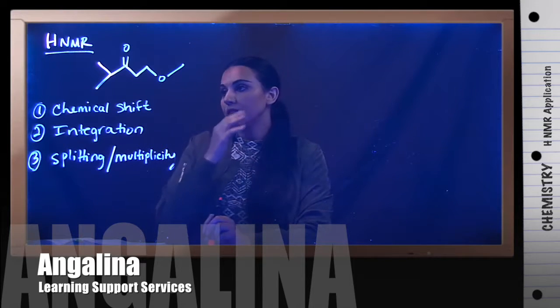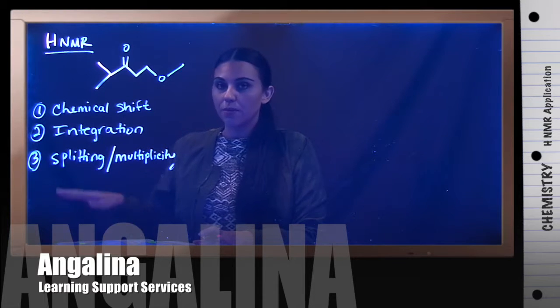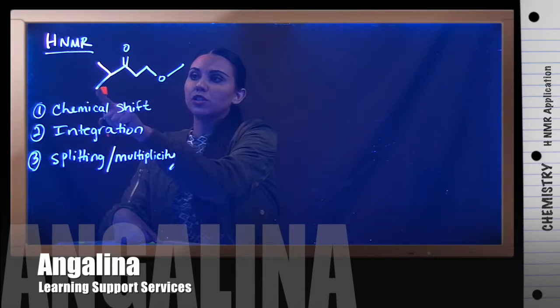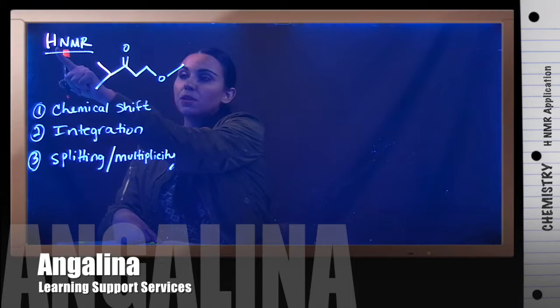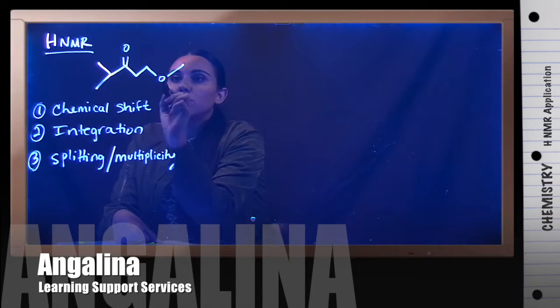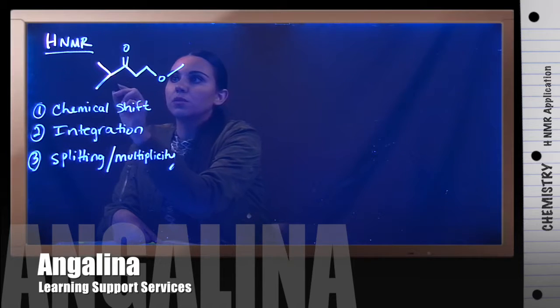So the chemical shift is probably the hardest thing. Most of you should have a table that your professors have given you, and they'll tell you the average values for these functional groups that we're looking at. Because we're looking at H-NMR, we first want to figure out how many different signals we're going to see for these hydrogens. Looking at this molecule, there's no symmetry, so pretty much every single hydrogen is going to have its own chemical shift.